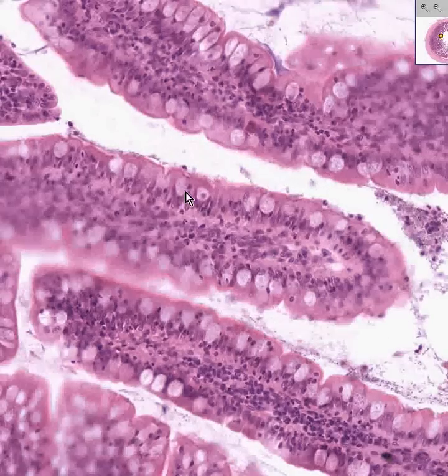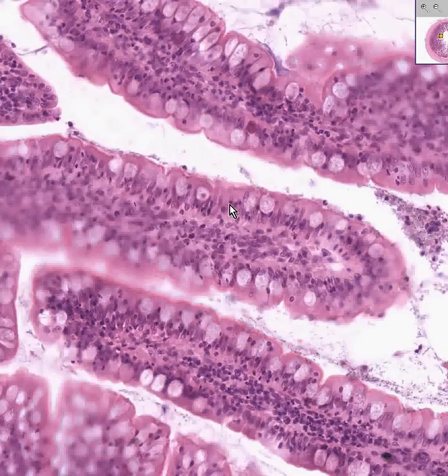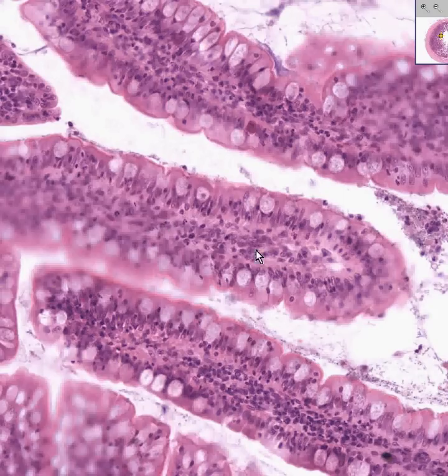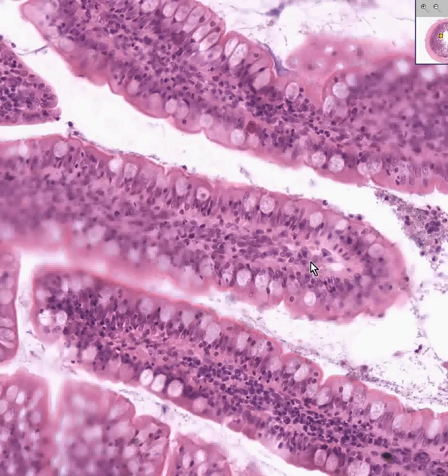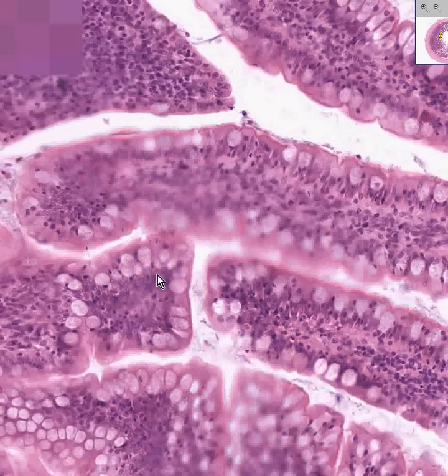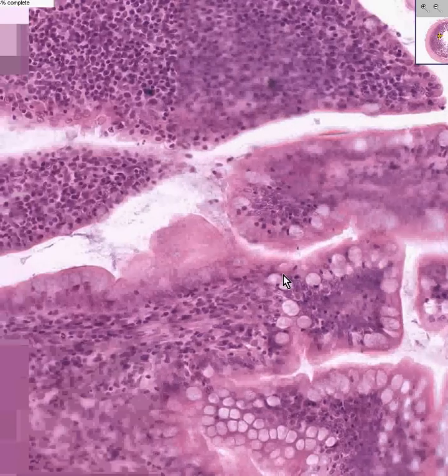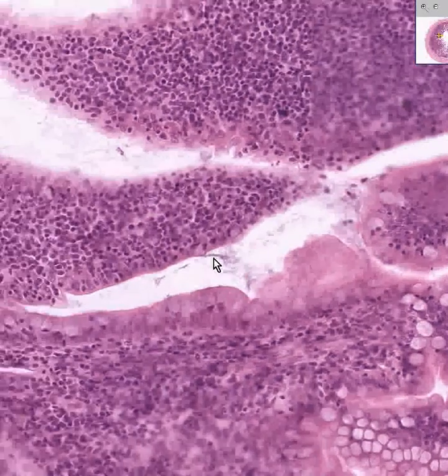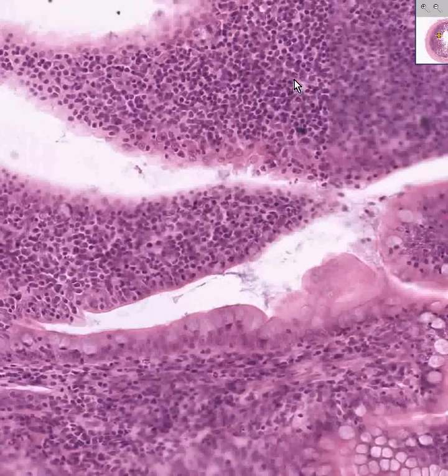Here is a goblet cell of the epithelium of the mucosa. Here are some absorptive cells. Here's the lamina propria with its various connective tissue and lymphoid cells — macrophages, lymphocytes, plasma cells. Here is a small blood vessel or lacteal. We are now traveling further into the deeper parts of the mucosa and can see the same type of arrangement, with a lot of lymphocytes.